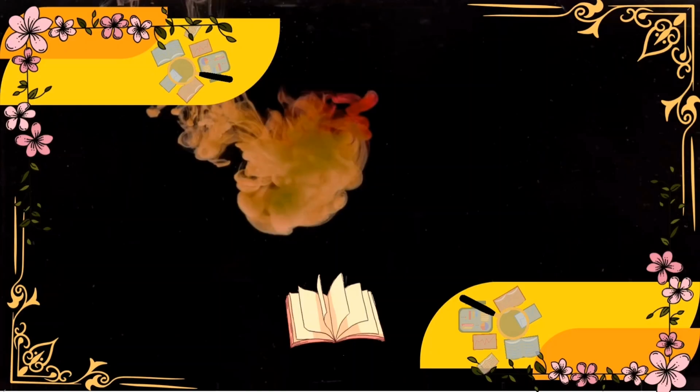Next is hydrometry. Hydrometry in food analysis involves using a hydrometer to measure the density or the specific gravity of a liquid food sample, which is related to the concentration of dissolved substances such as sugars, salts or alcohol. Hydrometry is used in applications like sugar content measurement, alcoholic beverage production, milk and dairy products. In products like fruit juices, syrups and wines, a hydrometer helps to determine the concentration of sugars, as denser liquids contain more dissolved solids.